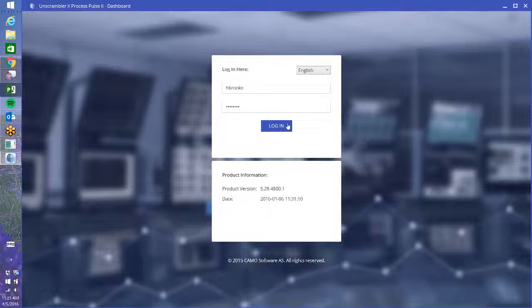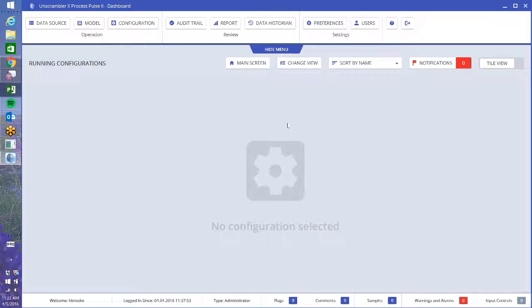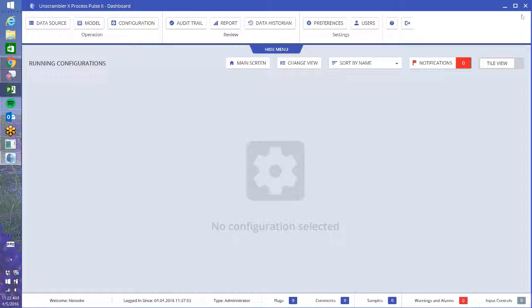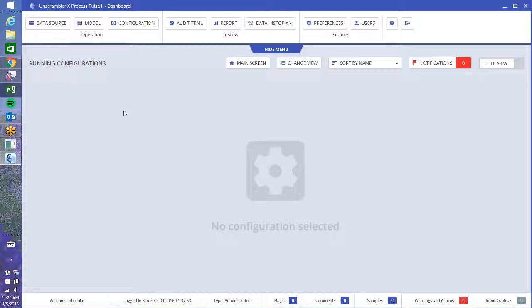There's administrator level, there's also developer who can build models and create configurations, and then you also have an operator level. Operators can only run configurations that are already set up in your system. It's pretty straightforward, I like to say it's as easy as 1-2-3.